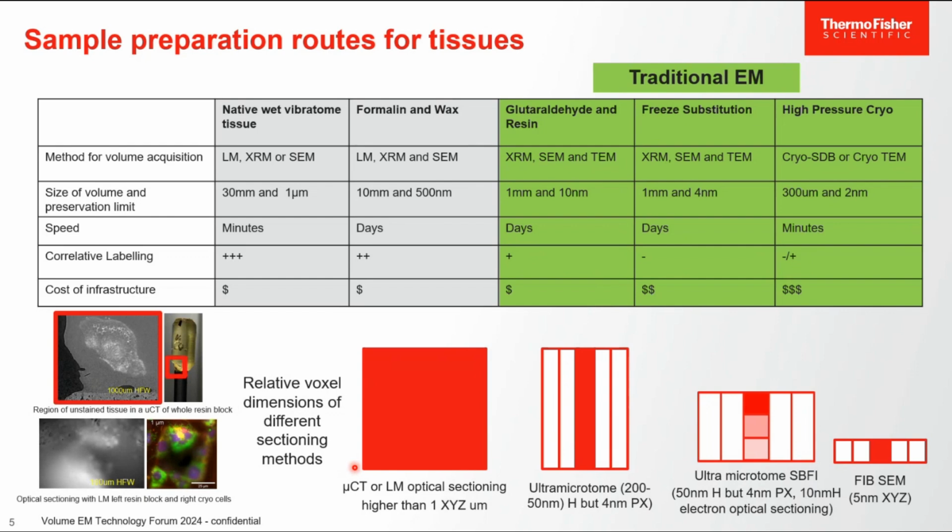I'm not really going to go into that, but whether it's with light, you can even with resin blocks, the sample on the left there is actually cells which are buried below some resin, and of course they're fluorescing, and of course you can use that for endpointing, the same thing that you can do with cryo work, which is on the right. For micro-CT, again, we've often used that in the past for localizing regions of resin blocks in the bulk to be able to excise it. And I think that's one of the things that we're working on, being able to take those coordinates and mill those out.